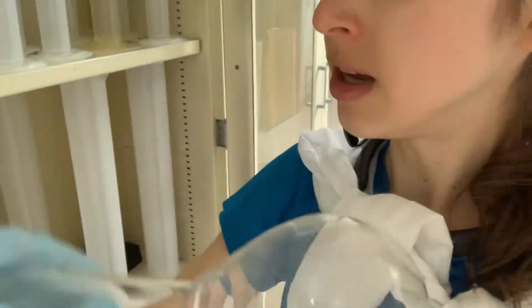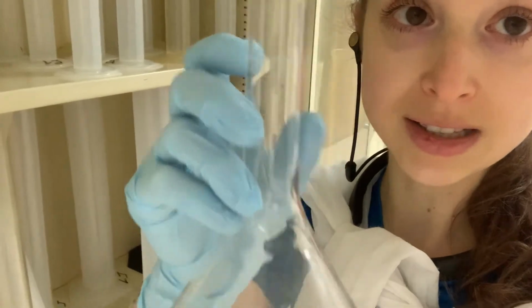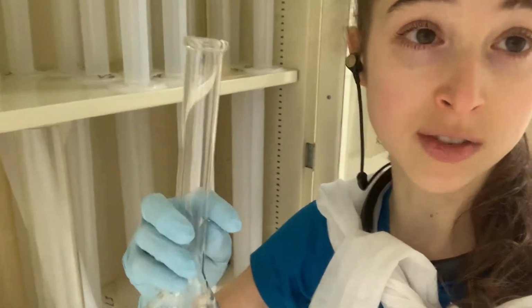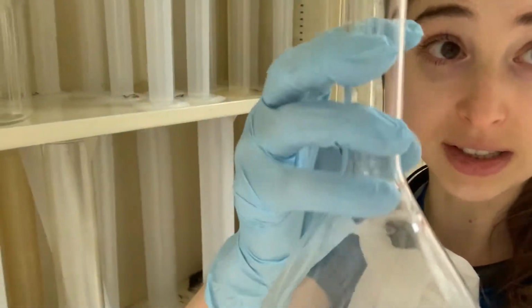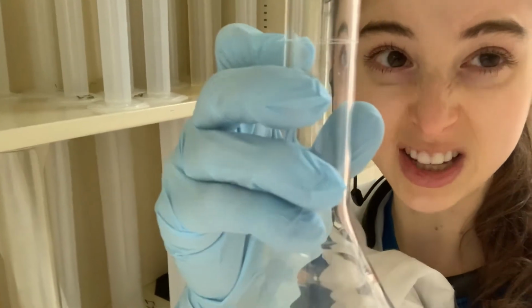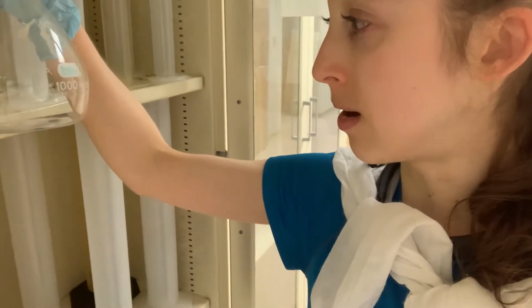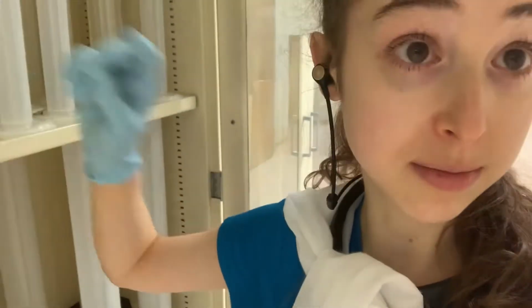But with the graduated cylinder, you have all those different options for different volumes that you want. With a volumetric flask, you only get a single volume. So you have a 1,000 one, a 100 one, or whatever. There are different sizes, but they're for different specific set volumes, and they have this single line. You can see they have this big flask part, and then a narrower stem, and this line is calibrated to be super precise. So if it's at the line, it'll be exact. Plus or minus 0.3 mils for this. So that's pretty good.